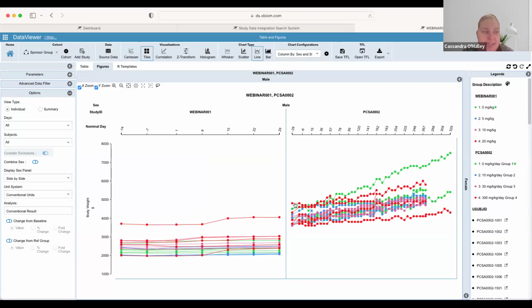On the right-hand side, though, these control subjects, which are seen in green, seem to be gaining body weight uncontrollably compared to the other dosed subjects. Now, this could be due to numerous factors, but we also see some of these dots in red are going down at some points. So for reference, this subject in green, over the course of about a year, it's 39 weeks plus an 8-week recovery period. This subject gains 3 kilos over the course of time. So it's gained almost 100% of its body weight.